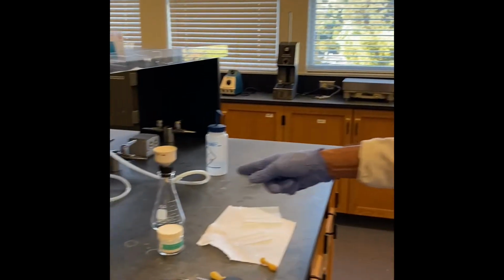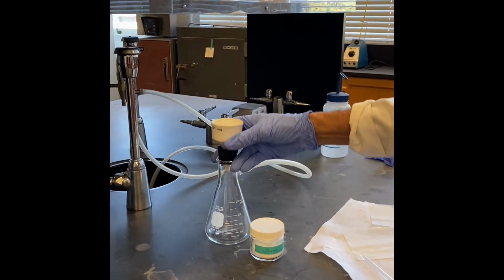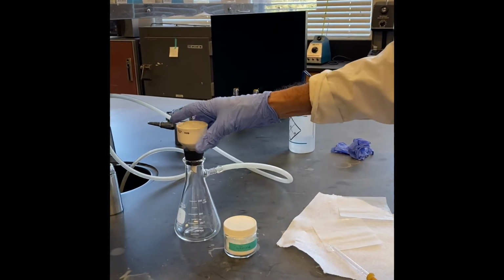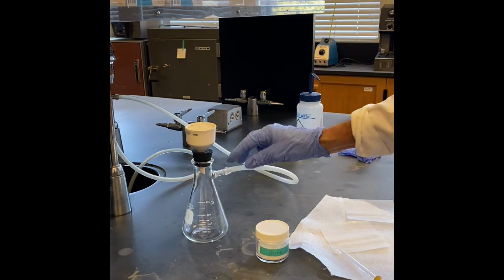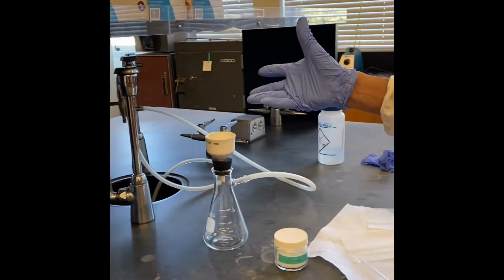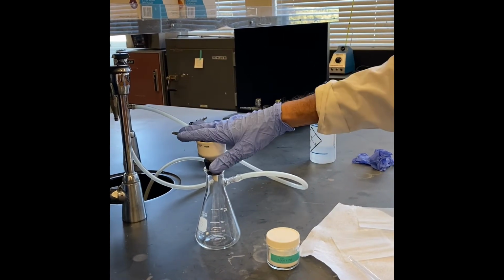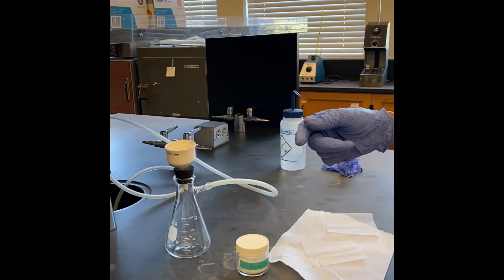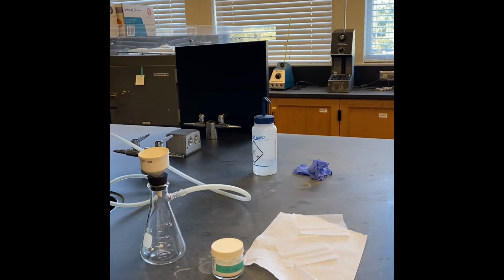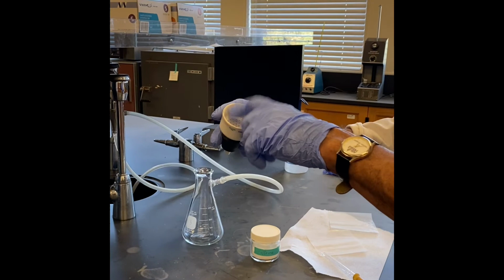For filtration, we have a setup here. This is called a Buchner funnel, right? And this is the filter flask. This filter flask looks like an Erlenmeyer flask, but it has a beak. And this is connected to a water aspirator here, because when you turn the water on, it gives a slight vacuum. So that is what we are doing. You take the crystals and filter in this. Actually, I'm not going to filter it, but I just want to show you. You just swirl and dump it here, collect it on the top.